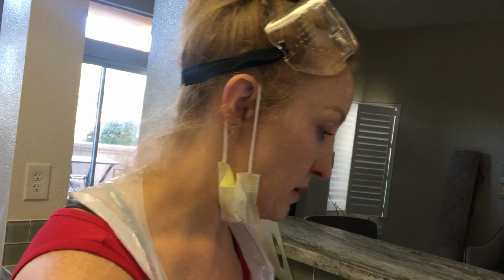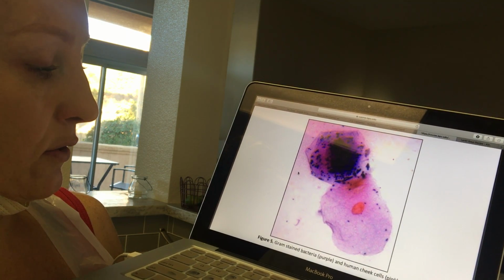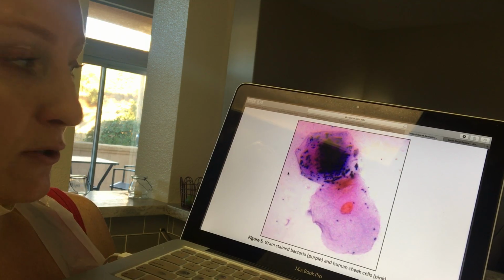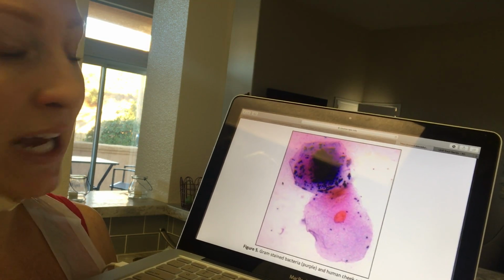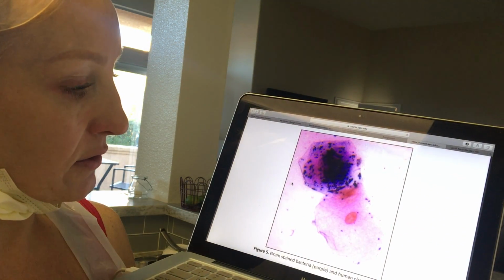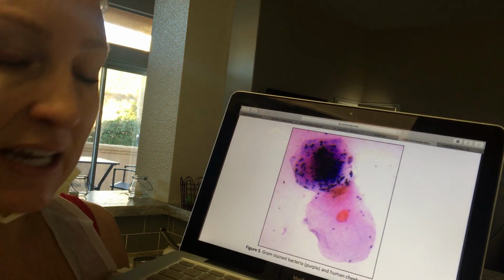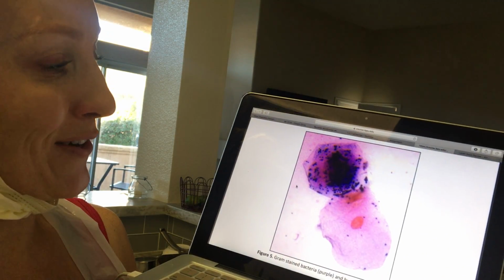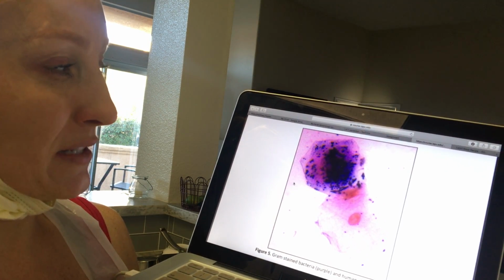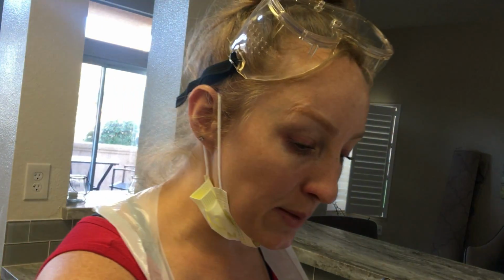This is gram negative. So the gram stained purple and human cheek cells. So you see gram negative in here and gram positive. So the dark purple, see the whole cell is colored, and then the gram positive is the background of the cell, which is the pink. The gram negative is the background of the cell, which is pink, and the gram positive is the purple from the violet. So you'll definitely see this in my lab. Now I gotta wash this guy off and take steps 2, 3, and 4 coming up next.